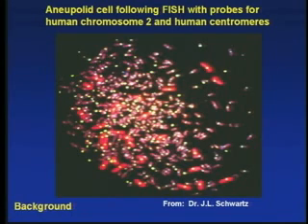This is an example of a tumor sample. You know, most tumor cells have multiploidy or polyploidy. So first you can just count how many dots to know the ploidy of the cell. Secondly, you just count how the dots are distributed on each chromosome.